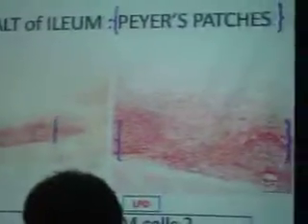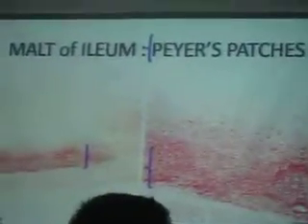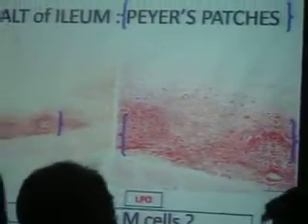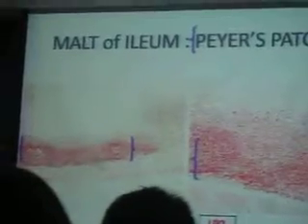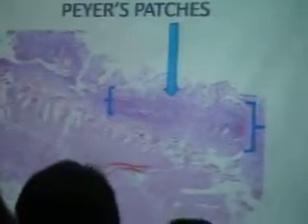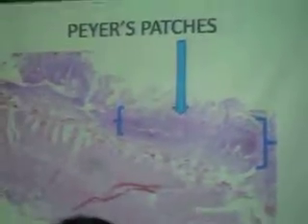But for your M cell, you only have a few microfolds. It does not have villi. You only have microfolds, konti lang. And this is the one that is exposed to the antigenic substances, so sila yung parareceptor. With the kinds of slide that we have, don't look for the M cells, but theoretically you should know them. Huwag nyo nang hanapin.